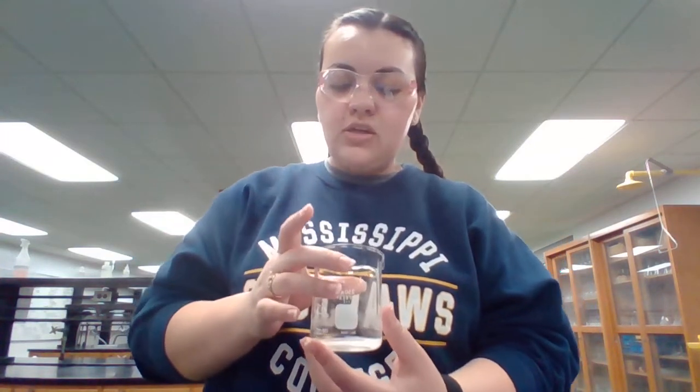Step 9 tells you that after your 10 minutes of letting that mixture sit in the beaker are done, then to collect the solid that forms on the funnel. So once it's done, and I don't know if you'll be able to see it, but I actually have white solid in the bottom of my beaker that I let sit undisturbed.